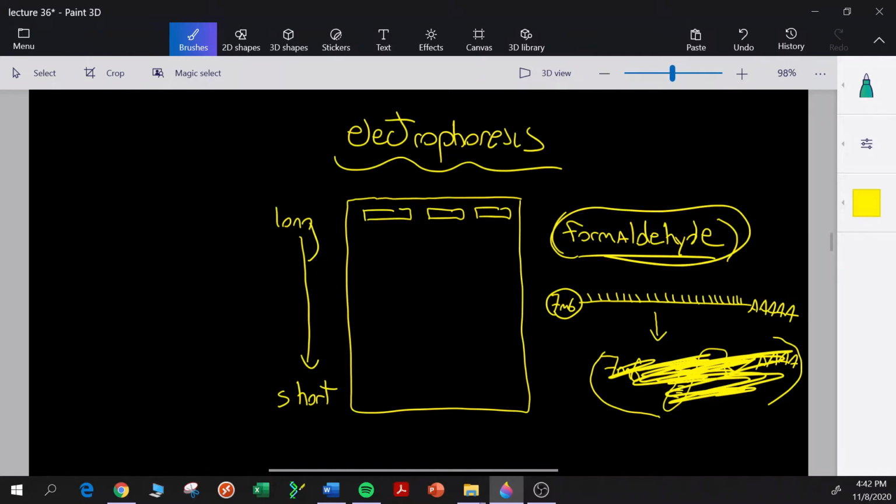Okay, say the RNA has migrated through the gel. We loaded the 0 time point in here, 1 minute in the middle, 2 minute on the end. And if we added, let's say, a stain that bound to the nucleic acids, and we took an image of the gel, well, we probably won't be able to see most of the RNA. If we had a ton of RNA there, we might see some smears.